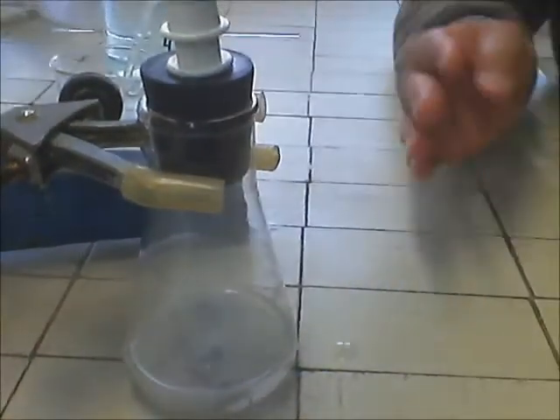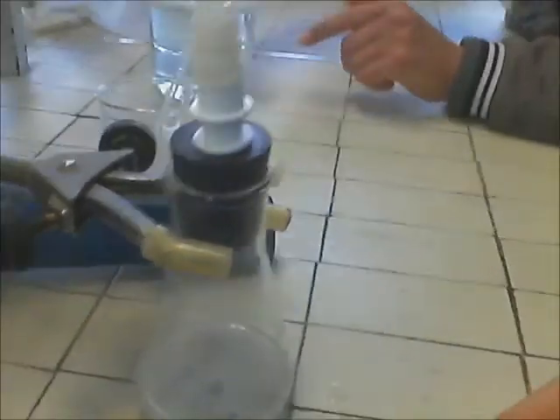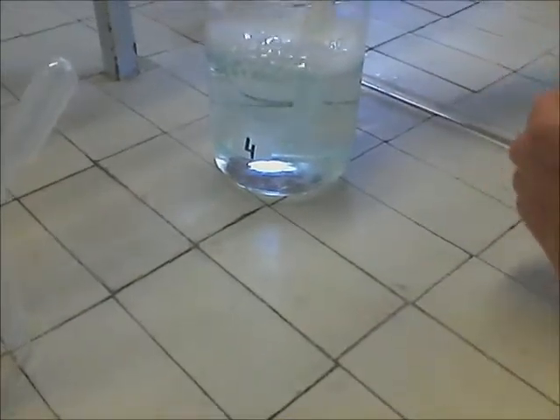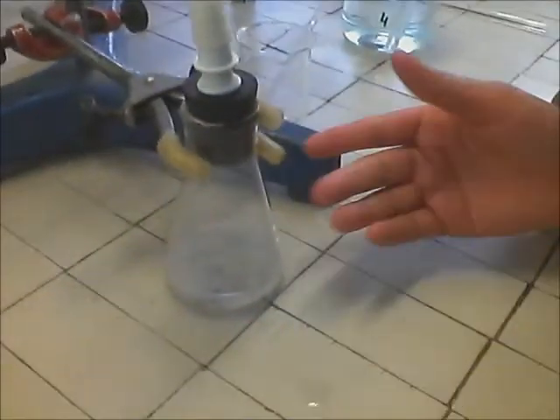Hem posat un altre vegada el clor hítric més fort i en la qual veiem bombolles molt més grans i que surten amb molta més rapidesa.